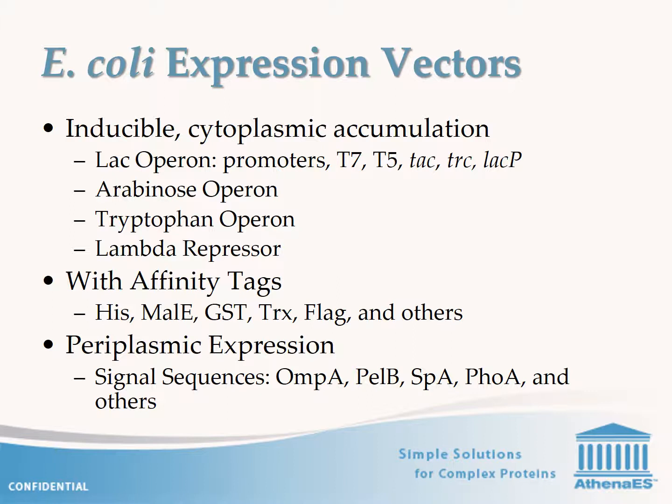In cases where proteins are toxic, need membrane translocation to mature, or have a large number of disulfide bonds, exporting the protein to the periplasm is desirable. Inserting a signal sequence code 5' to the coding sequence of the target protein places an export signal on the amino terminus of the protein, thereby directing it to one of three export pathways. This targets the protein to the periplasmic space and, in rare cases, exported to the culture medium.